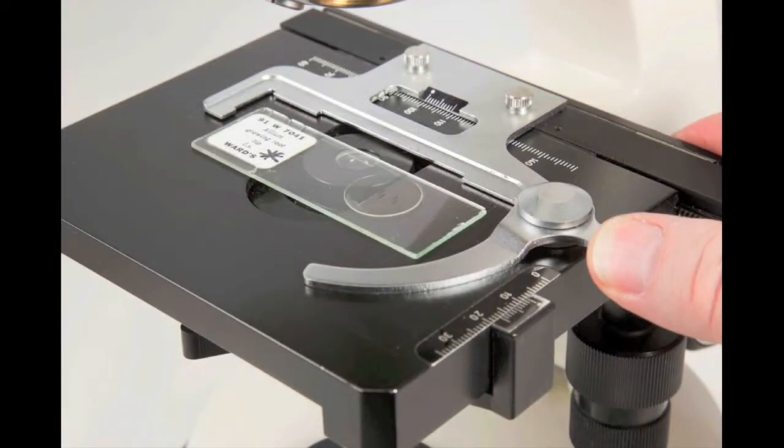To begin viewing a specimen, use the lever to retract the movable arm on the slide holder. Place the slide on the flat surface of the stage and release the lever. The arm will hold the slide firmly in place.